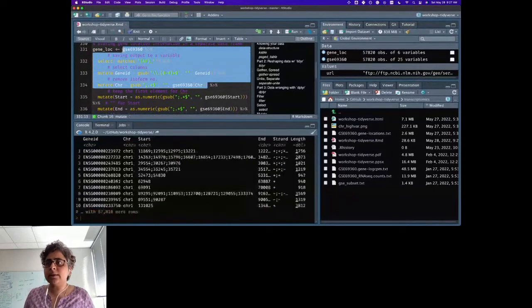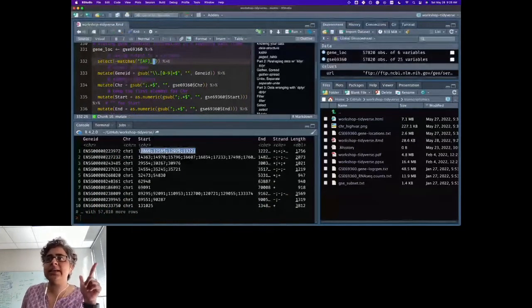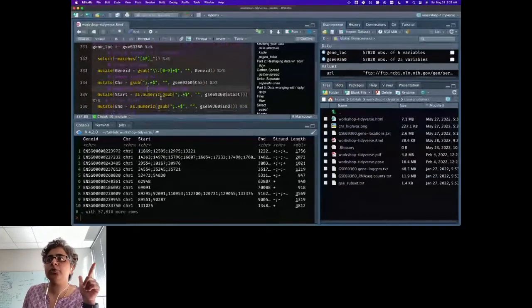So what does this look like? Now it doesn't have anything after the semicolon. So all of this is gone. It just says chromosome 1. Well, now you know how to do it for start. I'm doing exactly the same thing. I'm just keeping the first corresponding entry for each of them. So I'm doing the exact same operation also for start.